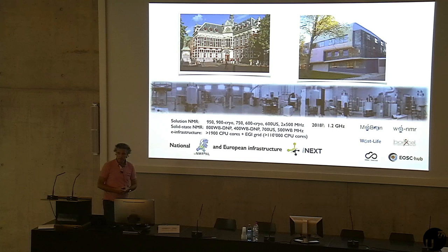So we are actually operating as a European large-scale facility for NMR through different projects, iNext, and the iNext Discovery one. So if you are in need of experimental access to NMR, you can come to Utrecht. And a lot of what we are doing on the computational side has also been supported over the years by different European projects that give us access to the computational resources we need to provide the services. The current ones are BioExcel, a center of excellence for computational biomolecular research, and the European Open Science Cloud Hub project, which is providing us access to high-throughput compute resources.